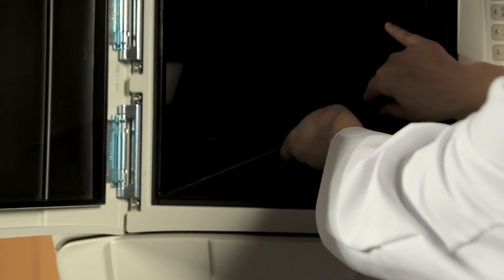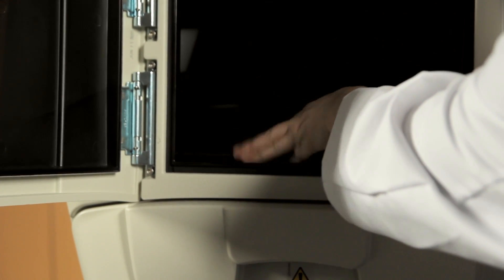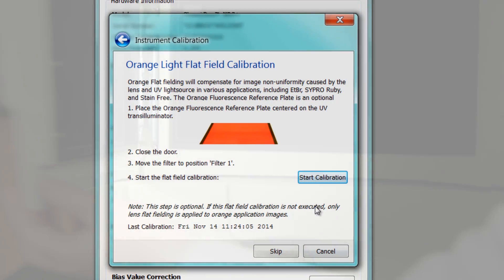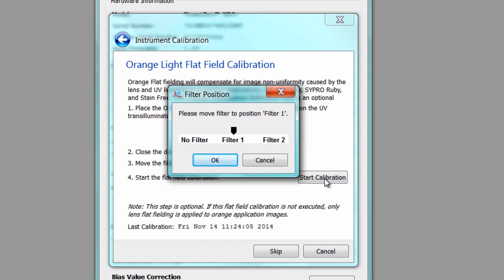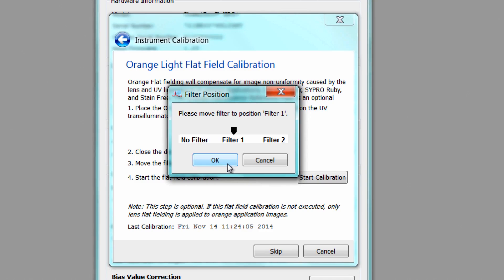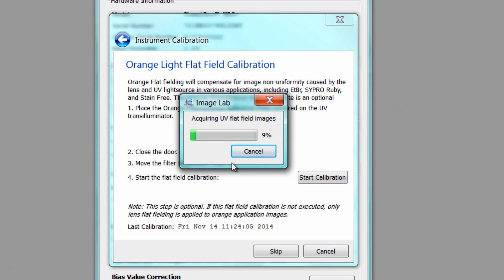You can now place the fluorescence reference plate on the imager transilluminator stage and close the door. Return to the software, click Start Calibration, and follow the on-screen prompts to move the image filter to Position 1 and click OK. The software will now run the Flat Field Calibration step. Once complete, click OK and remove the fluorescence reference plate.